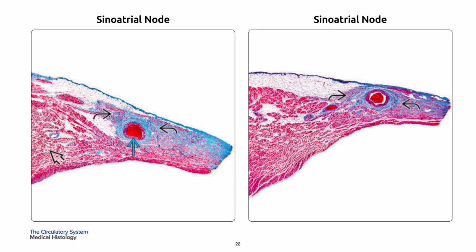On your left is a trichrome stained section at low magnification showing the atrial or terminal crest myocardium in a black bold arrow, sinus node arteries in a single blue arrow, and the sinoatrial node itself in a curved black arrow. They are characterized by intermixed dense collagen and small polygonal myocytes. On your right is a cross-section that illustrates the dense connective tissue-rich sinoatrial node tissue in a curved black arrow surrounding the sinus node arteries.